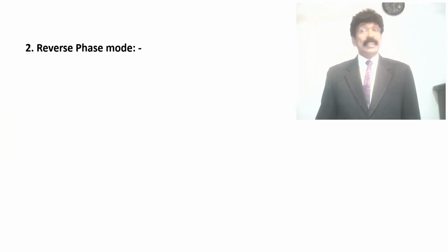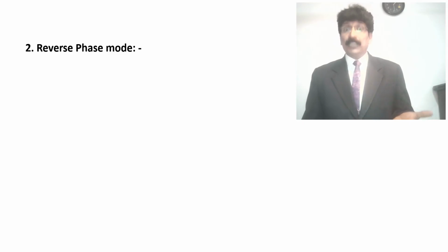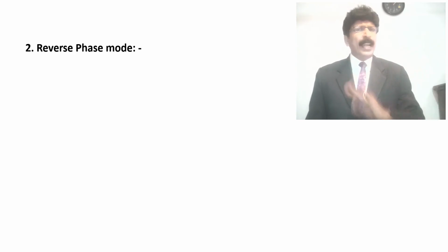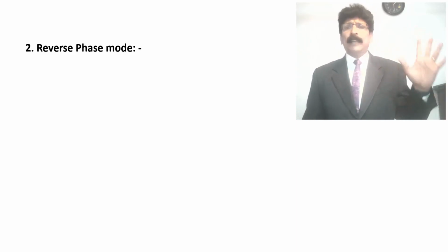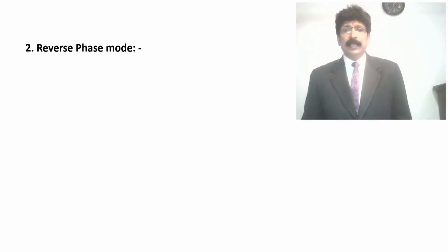So that is the reason the student should remember. Now you should know what the stationary phase is, what the mobile phase is, the importance of polarity, what we mean by polar and non-polar. Make it clear. The student can explain very easily. It's not necessary to go for any book reading. Listen, write, go ahead. It's just to write from the examination point of view, and almost all the chromatographies can be easily followed by the student.